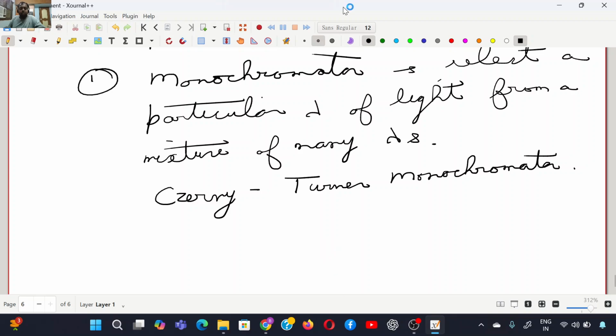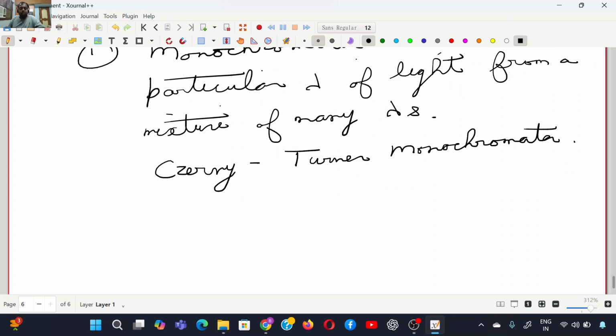Okay. Filter-based monochromators cannot be used in AAS because the resolution is too poor. So the lenses and mirrors are generally made of quartz or fused silica. Okay. The term monochromator is slightly misleading because it never produces a truly single wavelength of light, but always a small band of wavelengths. The job is to select a resonance line and reject unwanted background or other lines. If background radiation passes through, the calibration curve becomes curved instead of straight.